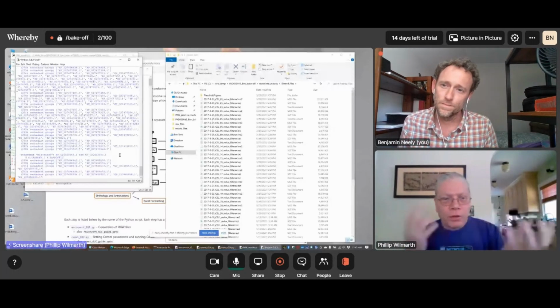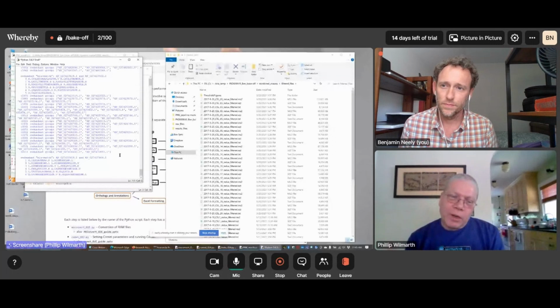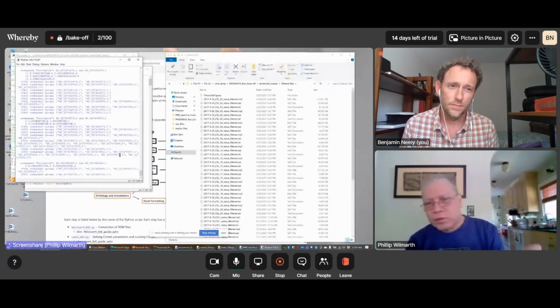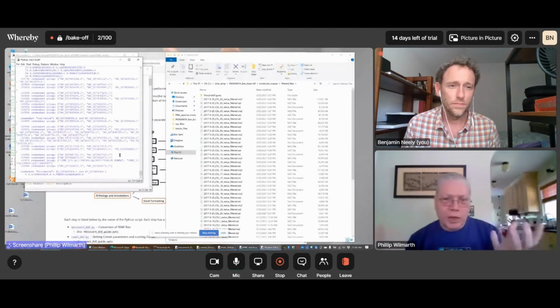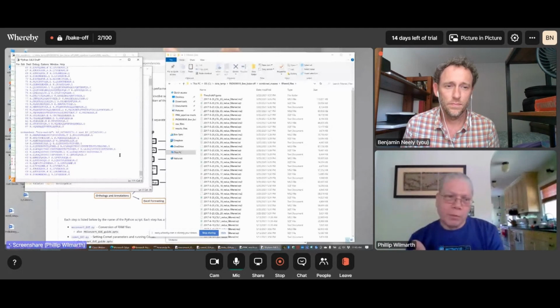So the first thing we're going to do, chugging through it here, is look for 2 proteins that have completely identical sets of peptides. And by identical, you always have to think about how the mass spectrometer works. So isoleucine and leucine are indistinguishable, so you have to make sure that you collapse those. But basically anything that's got the same collection of peptides associated with it, they're indistinguishable, and we lump them together. So that's the grouping step.